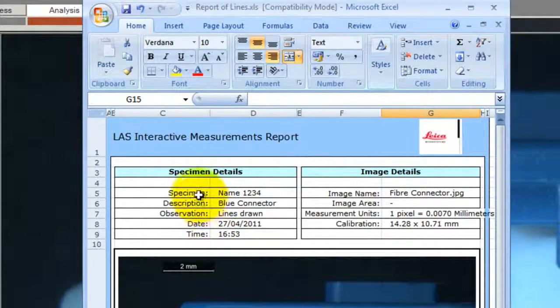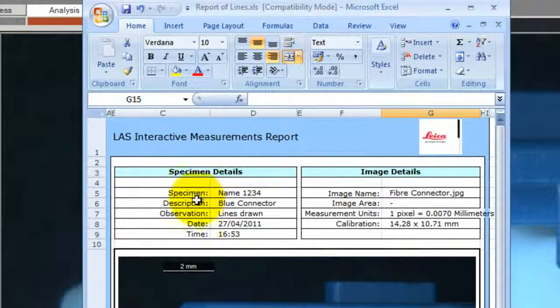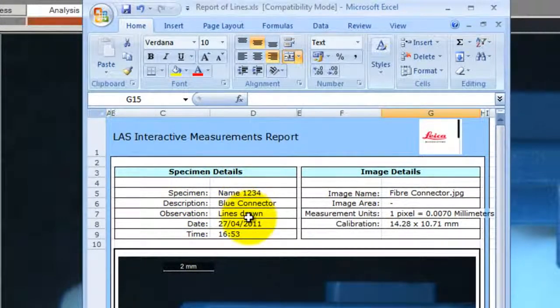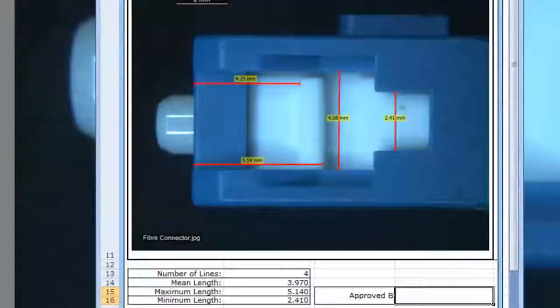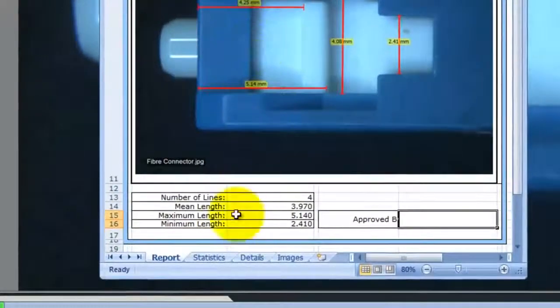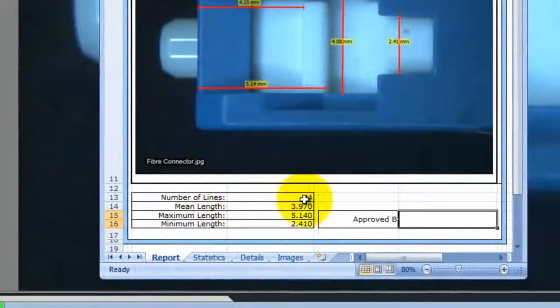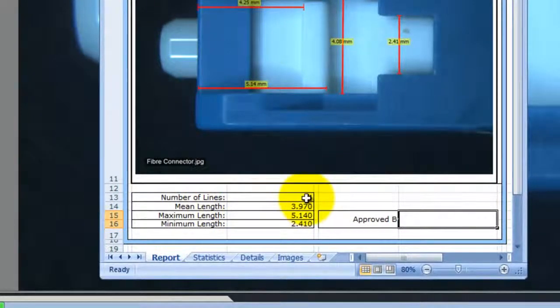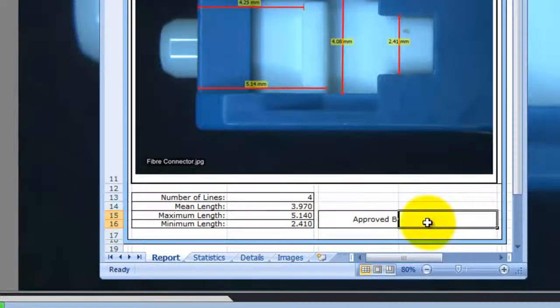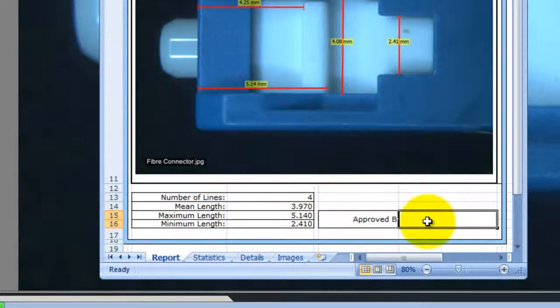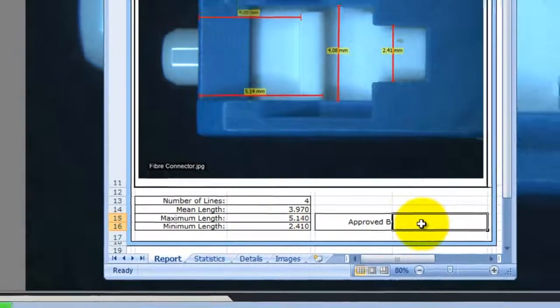The data that I typed in for the specimen details has appeared, and the number of lines that I measured has appeared down here. I can now print that out and sign the approval in the box just here.